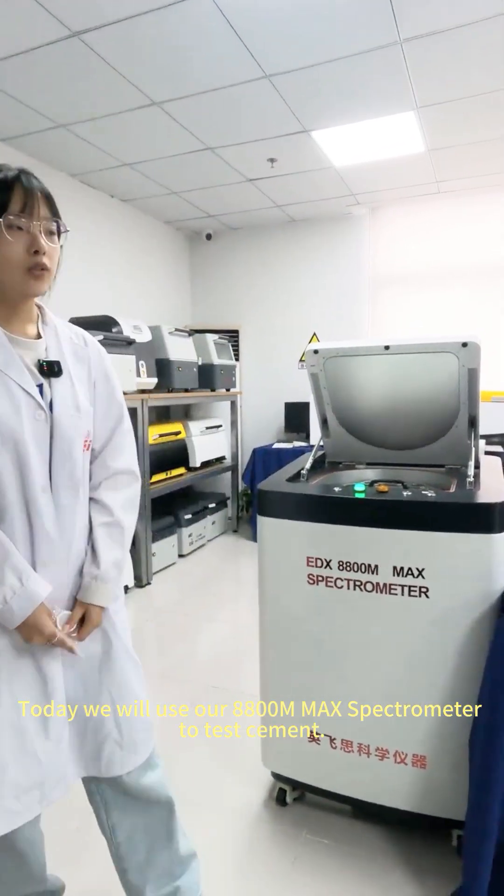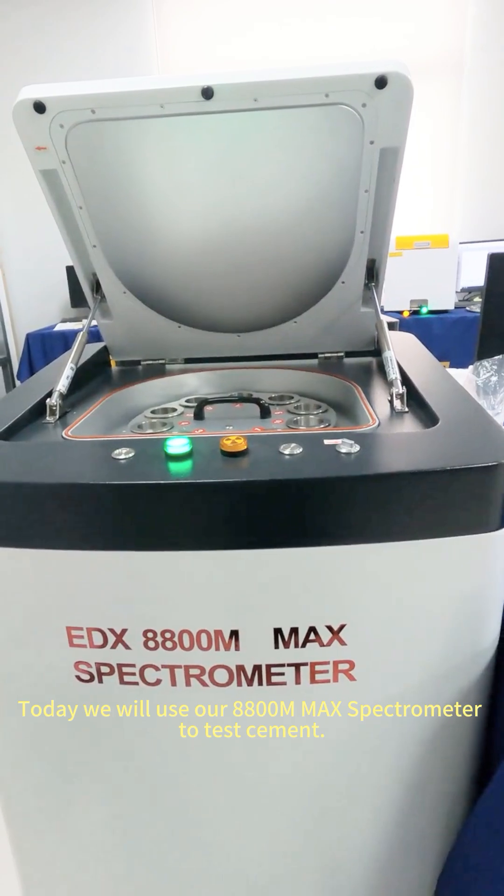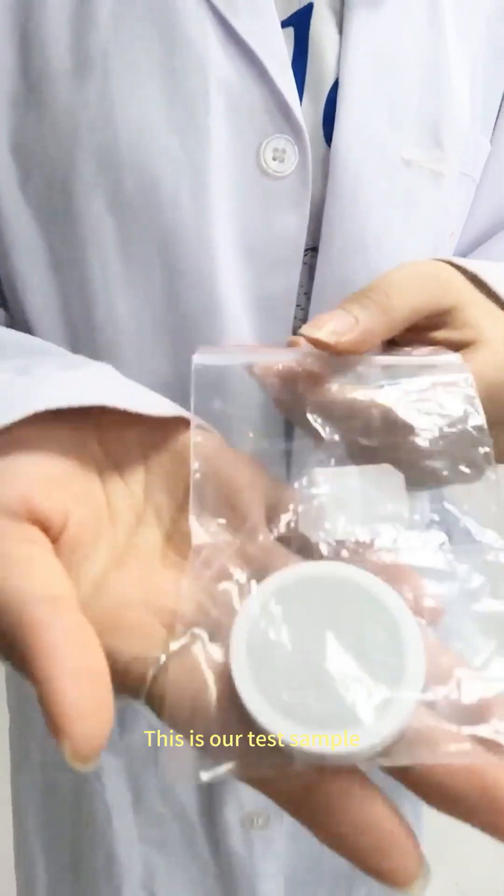Today we will use our 8800M MAX spectrometer to test cement. This is our test sample.